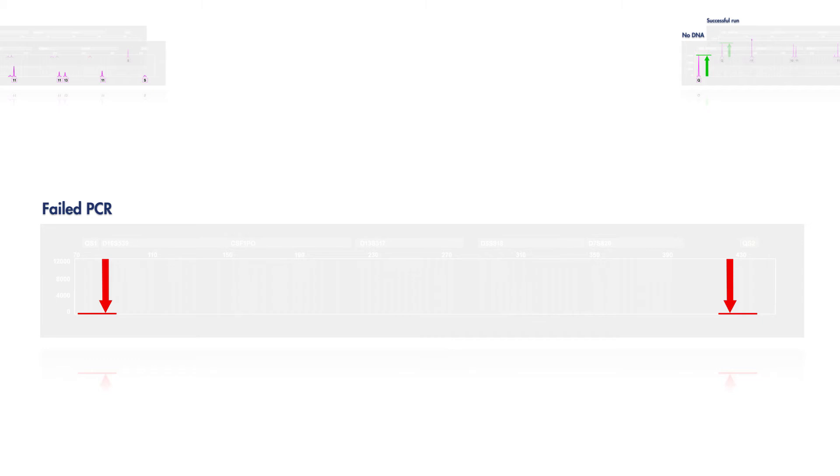No quality sensor peaks means failed PCR. Rerunning the sample and taking care to check each step of the protocol should produce a successful result.